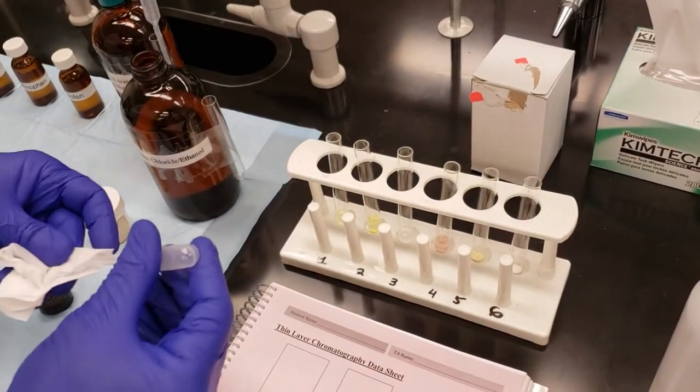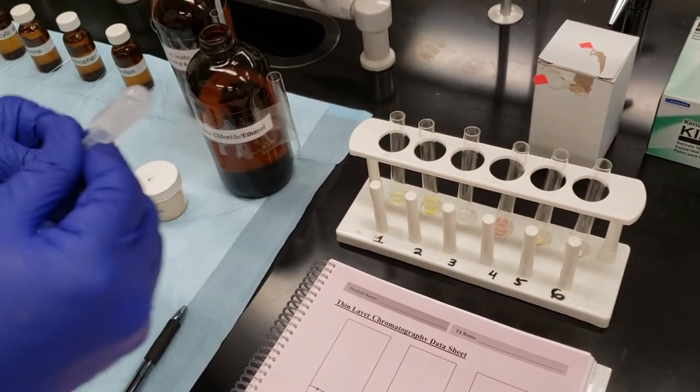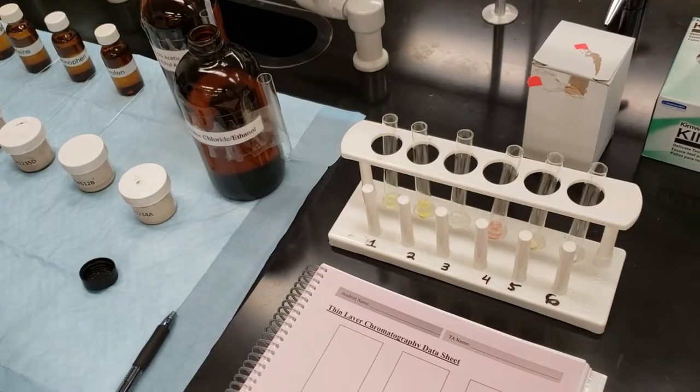I came into contact with a little bit of powder on the tip of this pipette, so I'm going to make sure that I clean it off. Again, I don't want any cross-contamination.